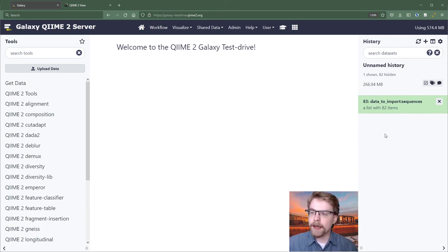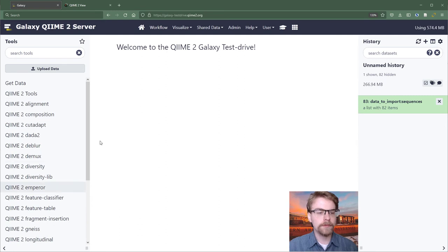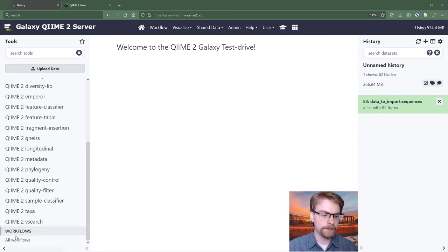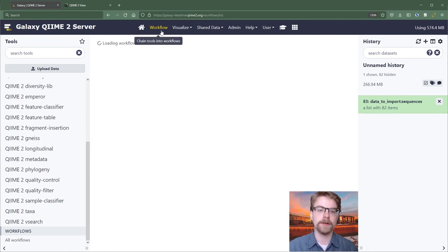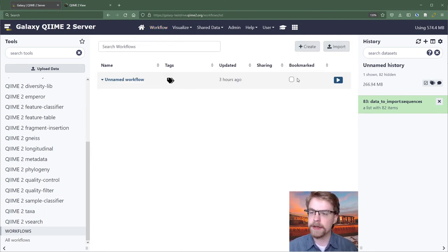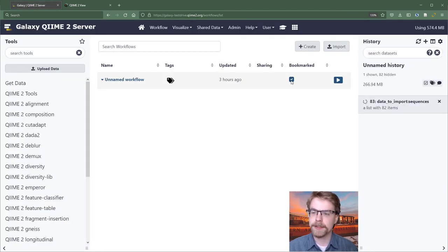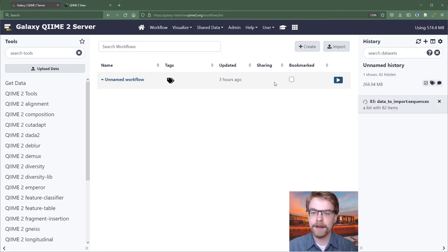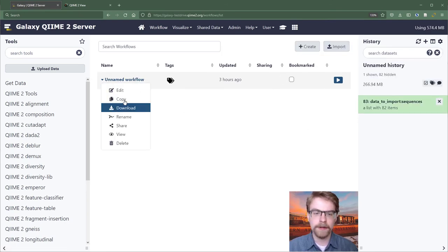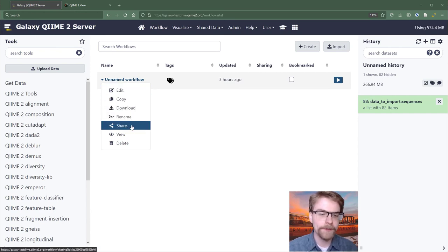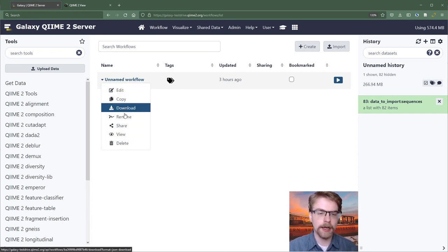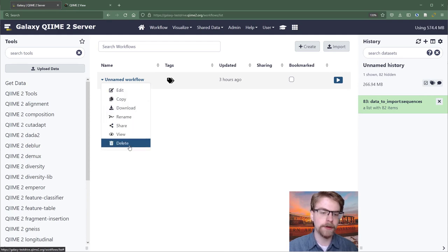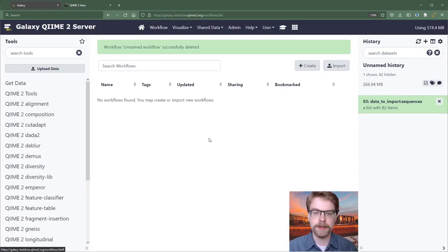The other pretty exciting feature that Galaxy has, in addition to all of these tool interfaces, is workflows. Now, I don't have any right now. But if I wanted to, I would go here. And I'm actually going to delete this one. That bookmarks it. As you can see, it is now bookmarked. So you click on this. I had forgotten. And so we can do a number of things, such as edit, copy, download, rename, share, view. I'm going to delete it. And we'll start this from scratch.